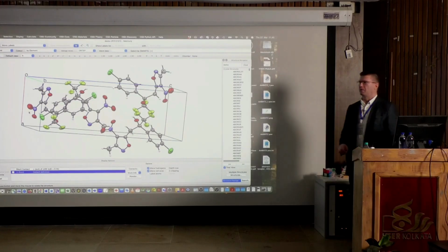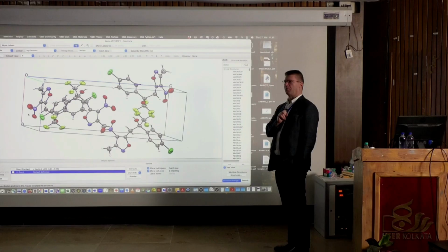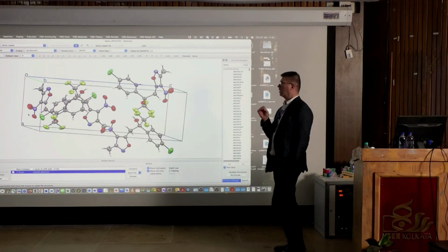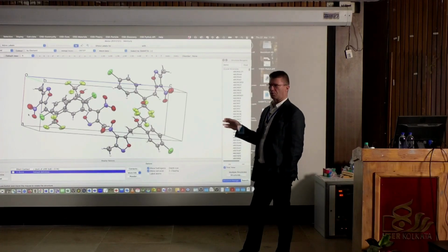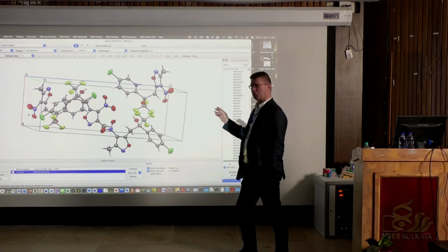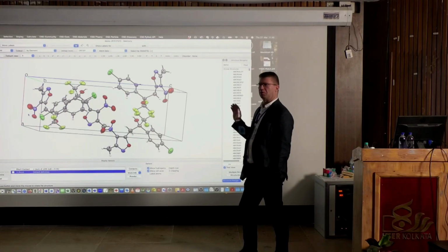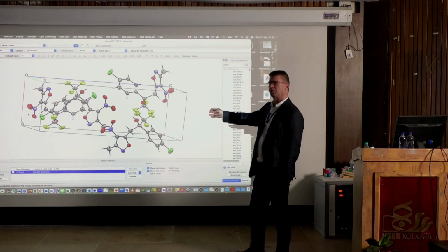And now, this is a typical mistake. In many of the forums you say that, okay, this is now a view along certain axes, so A axis or B axis or C axis. But if you look carefully, it's not. This is not along any axis because it's sideways.